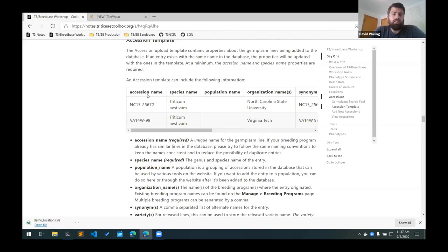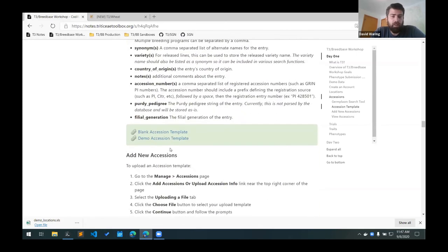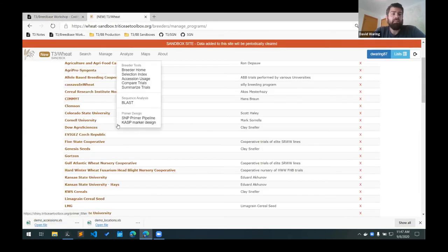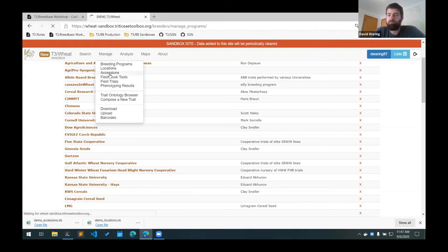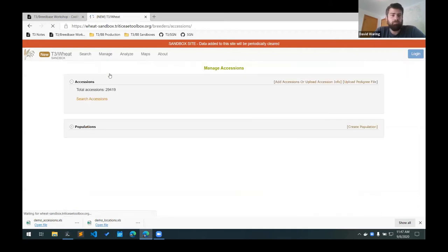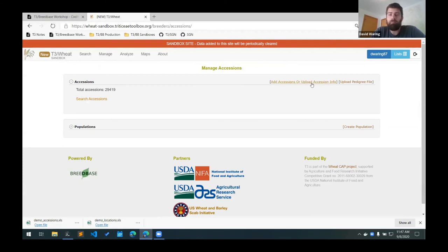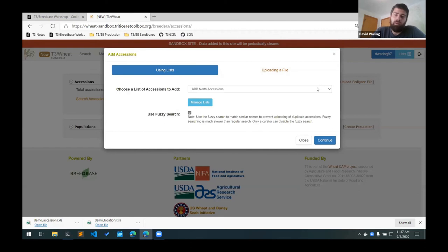So this is the example that I have for these two lines that needs to be added to the database. And what I'll do is I'll download that. And then to add the lines to the database, what you do is you go to the manage accessions page. And then there's this add or upload accession info button linked in the top right. So you click that. What we're doing is we're uploading a file.